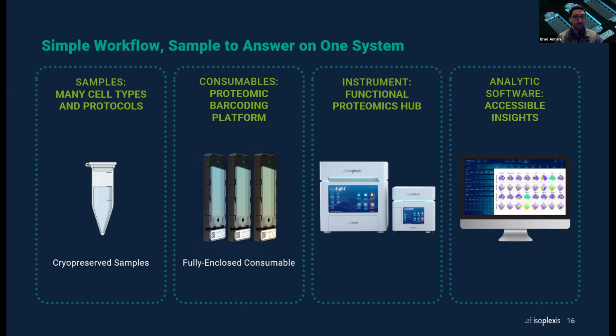So for example, if you were looking at CD8 T cells and the response that you would get from those T cells, you would use an enrichment kit to get down to the CD8 T cells. For an example, we typically have our protocols using the Miltenyi magnetic bead system. So you would use that for a positive selection, positive enrichment of those CD8 T cells.